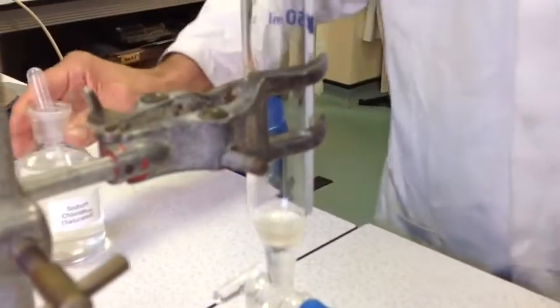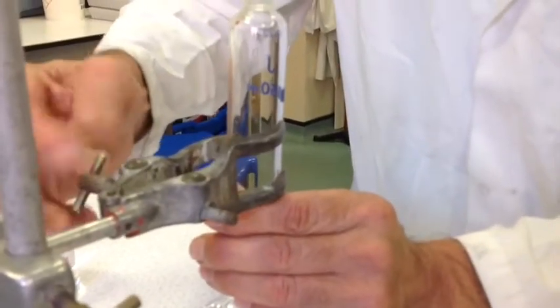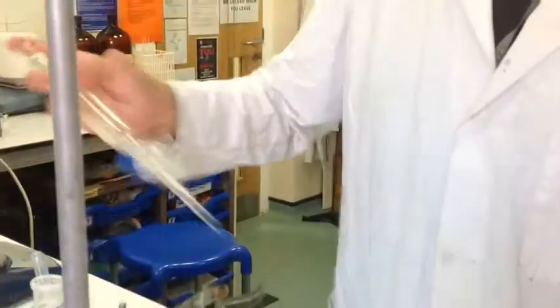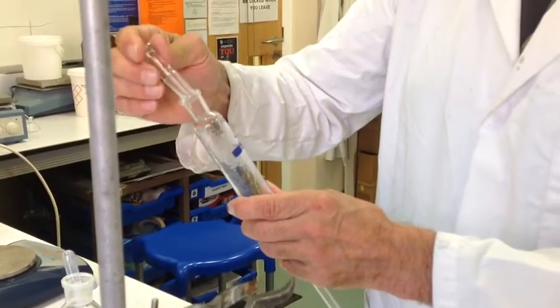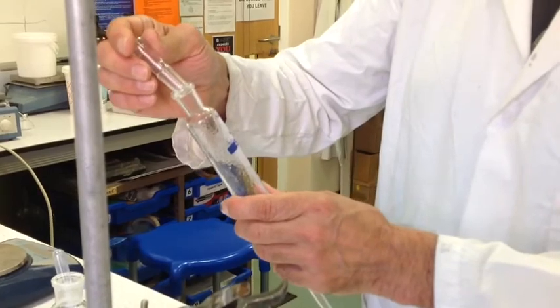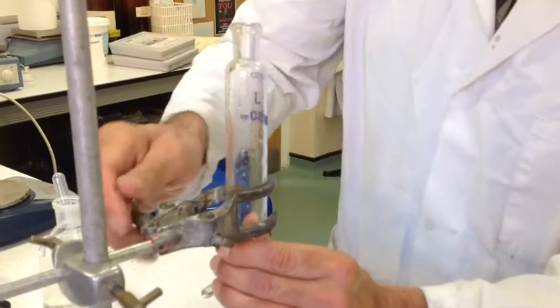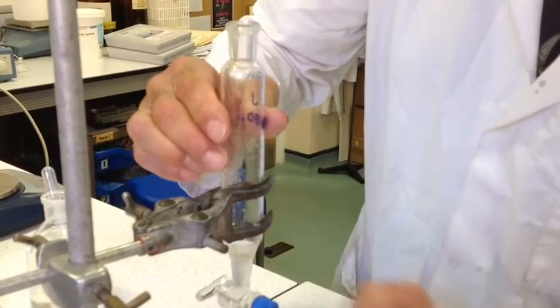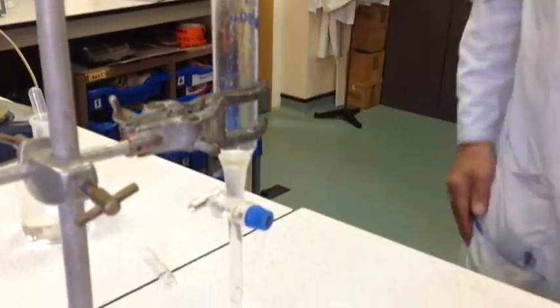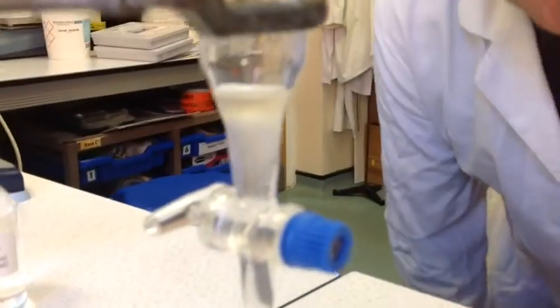Okay, I'm then going to stopper the separating funnel, remove it from the clamp, and keeping your finger on the stopper, give it a shake just for a couple of seconds. Then I'm going to release the pressure from the separating funnel. Point this away from you as you do so. We can then remove the stopper and clamp the funnel in a vertical position, and then leave to stand until you see distinct separation between your cyclohexene and the aqueous phase.